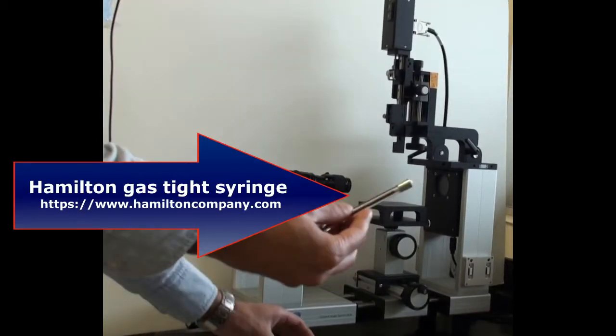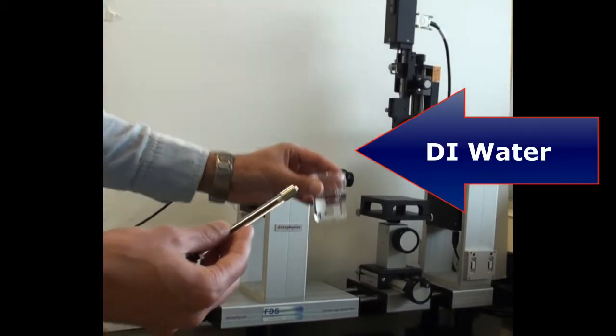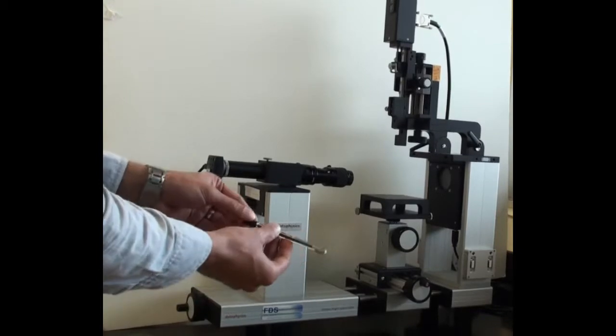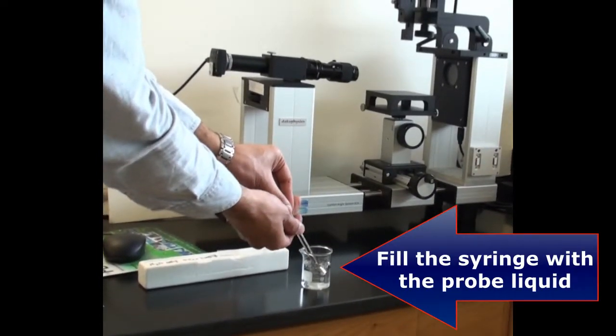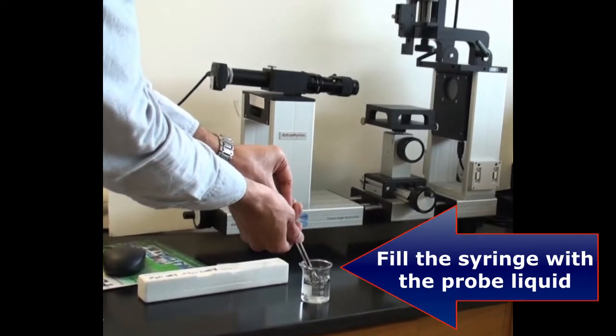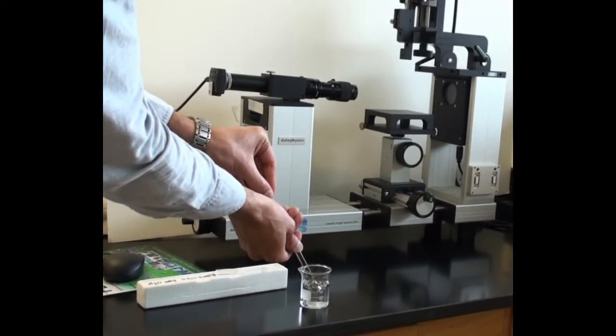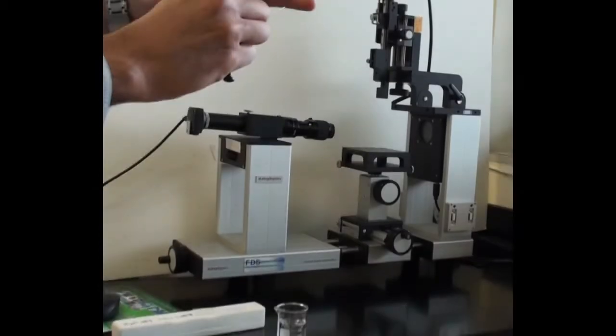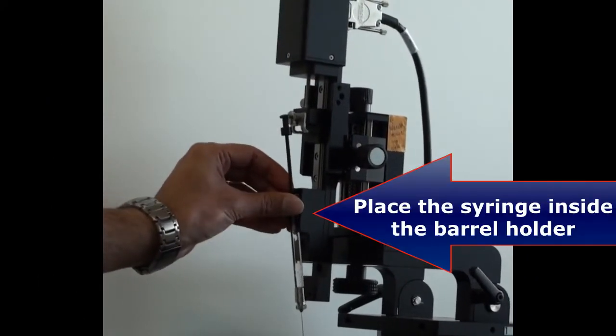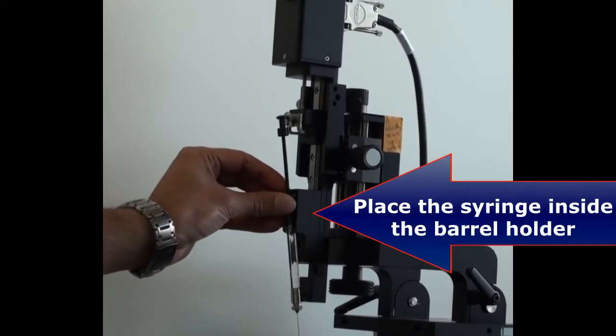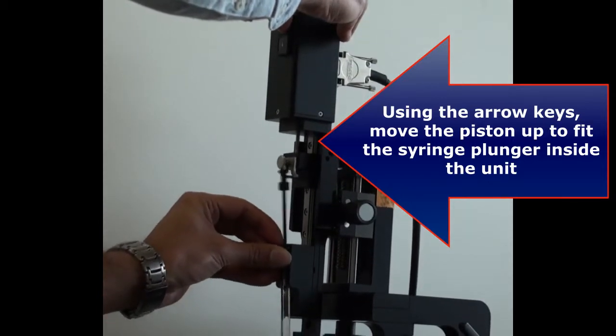Here we are using deionized water as the probe liquid. Put the head of the needle inside your liquid and fill it up. In this example, that's water. Put the needle back on the syringe slightly to be able to insert the syringe inside the unit.